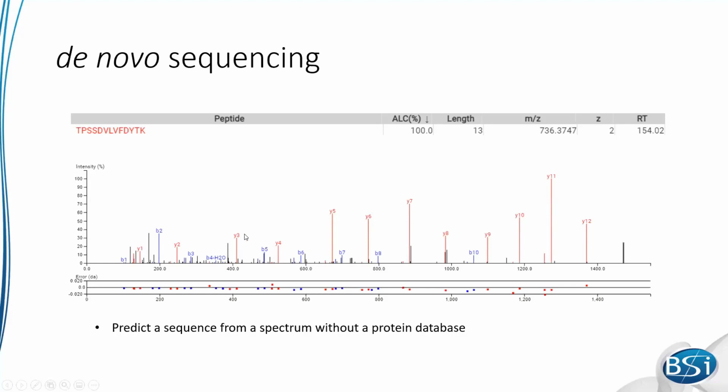Based on how many peaks actually match up to your predicted peptide, it'll do this thousands of times with all the different possible matches that can match up to your precursor mass. It will try to predict which peptide is the best match to the spectrum based on machine learning using known data sets. And then we give a result, which is the local confidence score, the average local confidence score for all the amino acids in the peptide, to signify that we are confident or not confident in the peptide sequence.